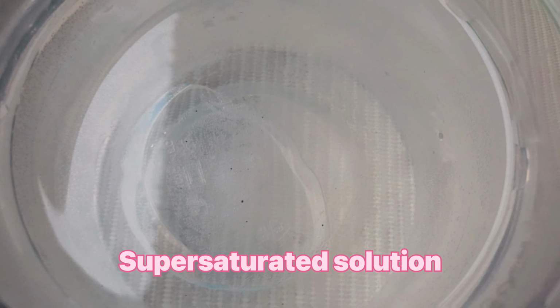Because of that, when the salt is added again, the dispersing phase, or the solvent, is not able to dissolve it again, and it will produce more sediment. Okay, my practicum is done.